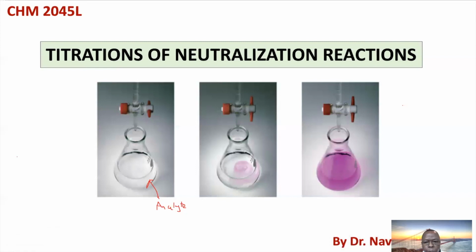my left flask. There is the pink color, which indicates that the titration is complete. So with that, we'll have to stop the titration. And if we know the volume used to titrate the analyte, we can use the stoichiometry to find the mole ratio and know the number of moles in the analyte, and then we find the concentration based on that.